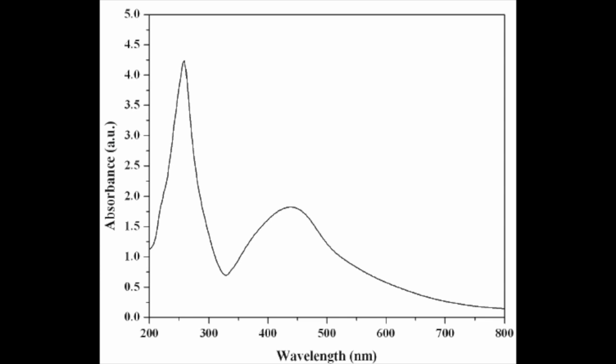Another reason why you should scan across all wavelengths is so that you can compare the absorption range of a substance at each specific wavelength. Comparing the absorption of a substance at various wavelengths can allow you to identify an unknown solution by comparing its absorbance across the same ranges to a known substance's absorbance.